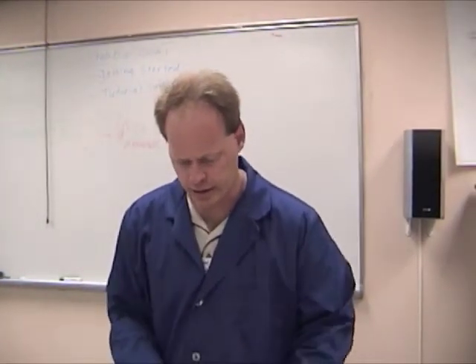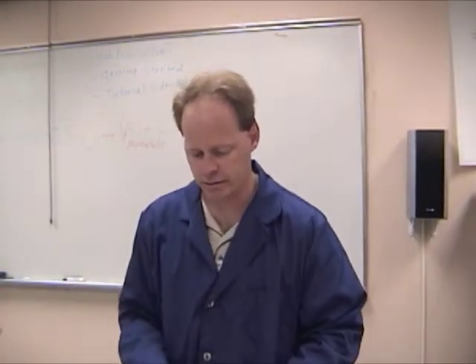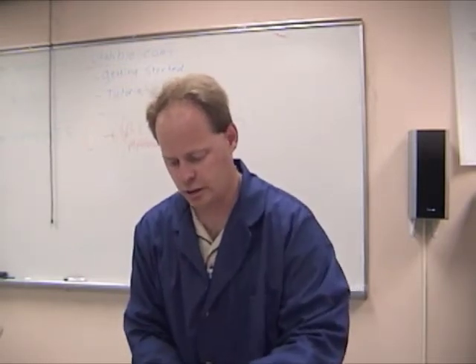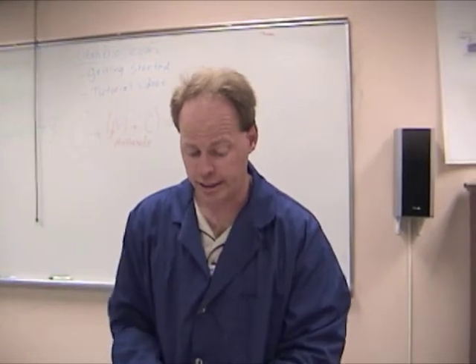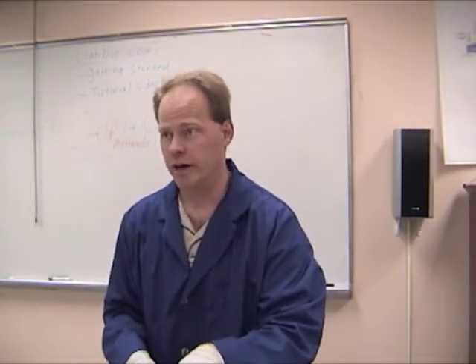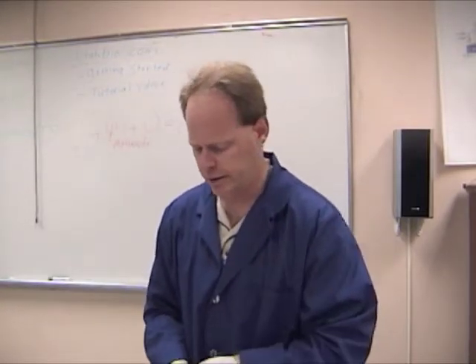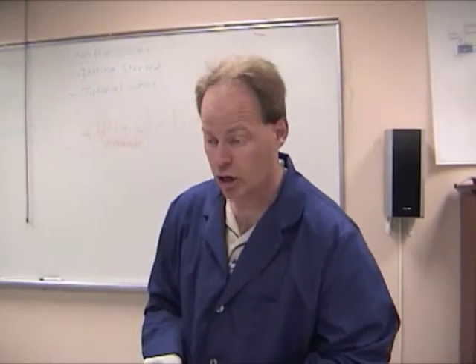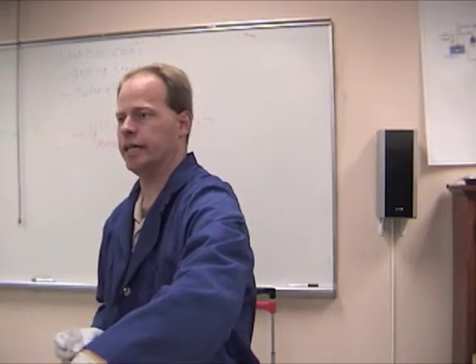Okay, to do that, I'm going to turn the scale on. I'm going to put this on. Oh, it covers off. Is there one of those scales in that titration kit? There is, yep. And I need to tare this scale. What that means is I'm weighing the value of this little vessel that I've just put on the scale, and taring out the value of that. So my scale right now is reading 0.